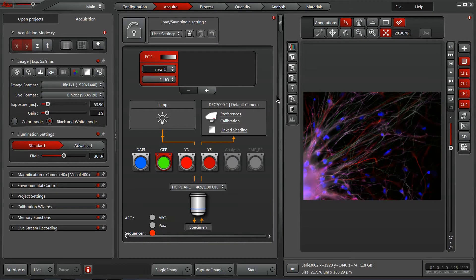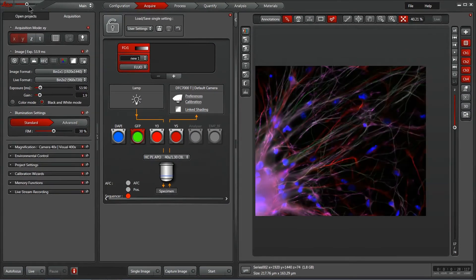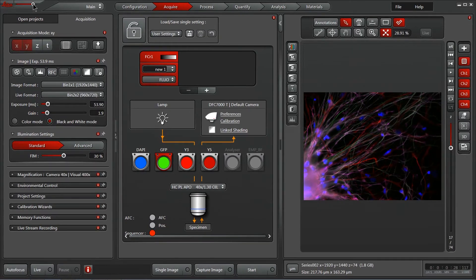To begin our overview of the Leica LASX software, we're going to start by showing how easy it is to customize the display of our interface to accommodate your particular monitor's resolution. Starting up here on the top left, you can grab a hold of this little circle and adjust the size of the text and the graphics displayed within our user interface. I'm going to keep mine at the largest size here so that it's easy to see.